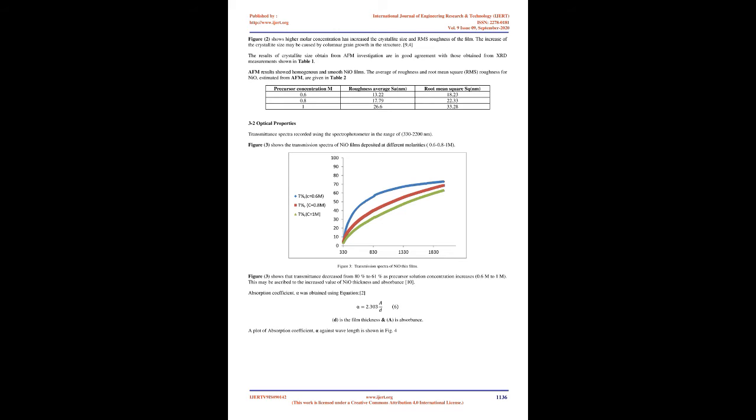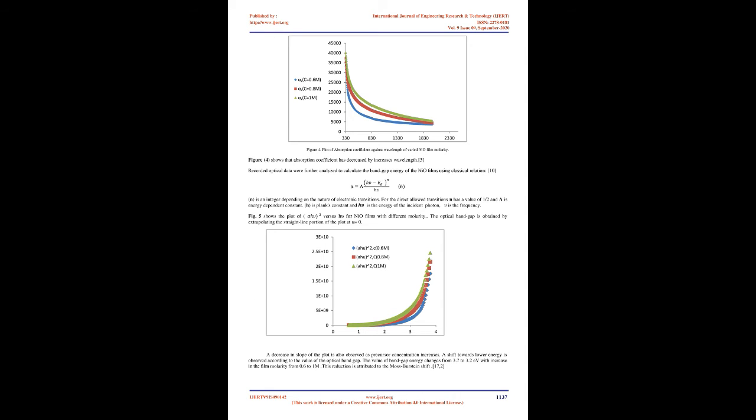2. Experimental. Nickel oxide thin films were deposited from aqueous solution of NiCl2·6H2O by SPT on glass substrates. Precursor solution was NiCl2·6H2O of concentration 0.6 M, 0.8 M and 1 M. This was mixed and stirred in 50 ml distilled water for 10 minutes. The substrates have been chemically cleaned by standard methods. Nickel chloride solution was sprayed onto the preheated glass substrates, which undergoes evaporation, solute precipitation, and pyrolytic decomposition, thereby resulting in nickel oxide thin films according to the following reaction.